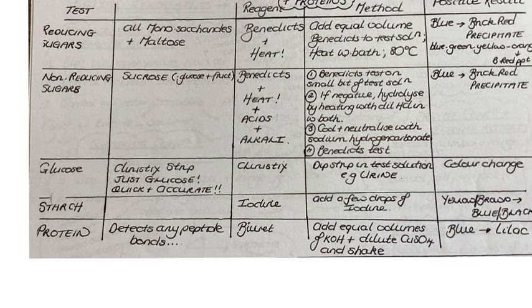And then the last test that I'm going to talk about is the protein test. The reagent that tests for protein is blue biuret, and blue biuret actually tests for peptide bonds. It detects peptide bonds, which are obviously inside proteins. So how do you carry out the biuret test? We usually give you blue biuret, but I want you to know how to make up biuret.